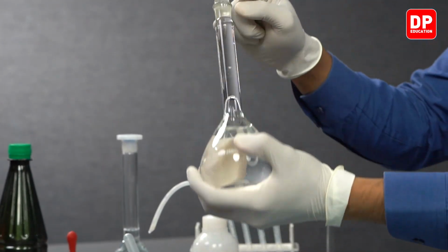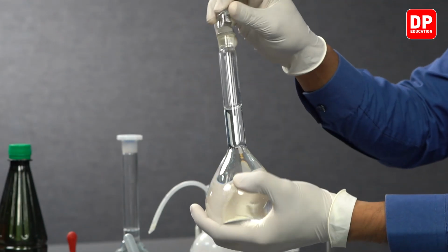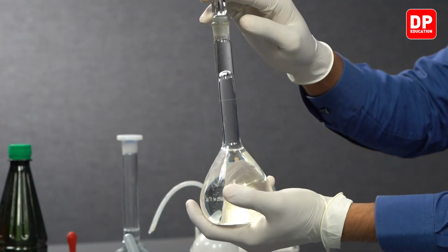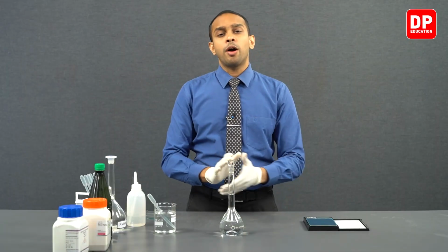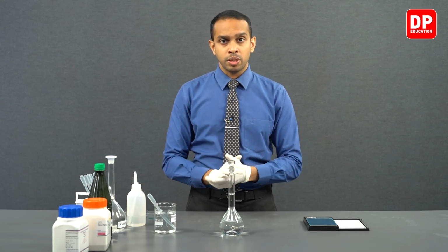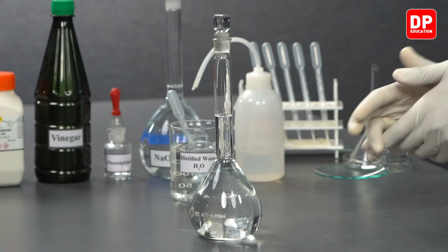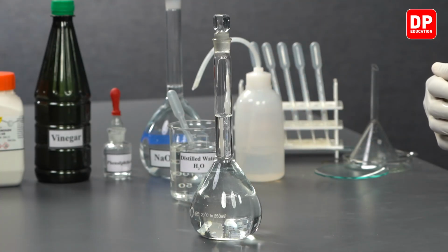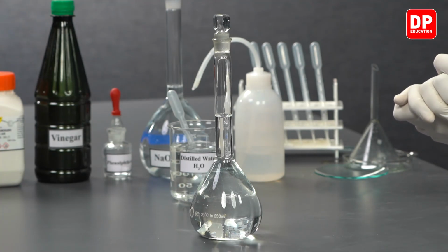the solution that we have made is a homogeneous solution, by mixing the contents inside the volumetric flask really well by turning it upside down a couple of times. Now we have prepared our 0.2 moles per decimeter cube concentrated potassium hydrogen phthalate. So the solution in front of us is the potassium hydrogen phthalate solution that has a concentration of 0.2 moles per decimeter cube.